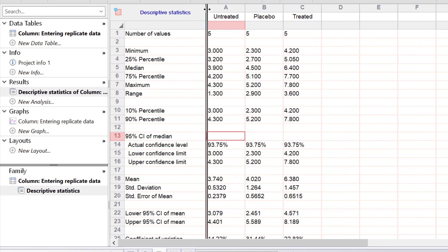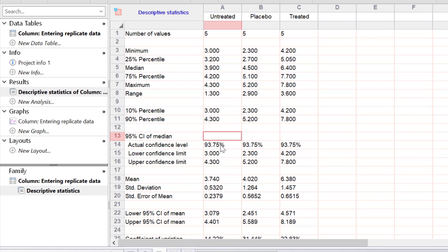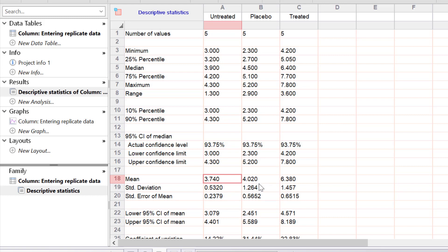Underneath, we have the 95% confidence intervals for the median value. GraphPad has returned an actual confidence level of 93.75% based on our n numbers, with a lower confidence interval of 3 and an upper of 4.3 — meaning we are 93.75% confident the true population median lies between these values. Further down, we have the arithmetic mean, and as you can see the treated group has the highest average overall. There's also the standard deviation — again the treated group has the highest, meaning more variation in that data set — and similarly the standard error of the mean is highest in the treated group.